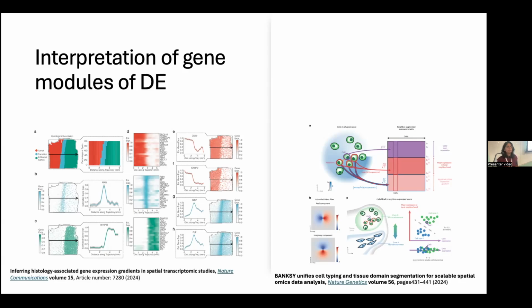So I cannot say for sure that when you get your spatial clusters, your standard differential expression analysis will give you the enriched genes that are biologically reliable. A lot of collaborators that I've worked with... there's a collaborator where I did just a tissue microarray course, but I didn't do spatial clustering.